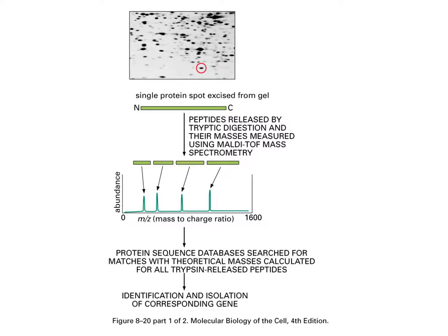mass spec. So now theoretically, any new virus, bacteria, we get the genome, we can look at say the very virulent strains of these new pathogens, and we can figure out what the proteins are that are in the virulent strains that maybe are not in the less virulent.